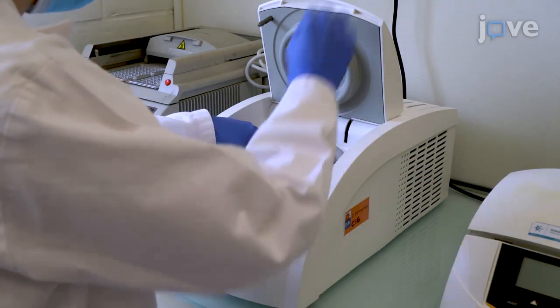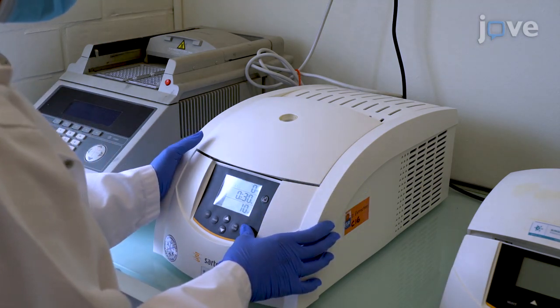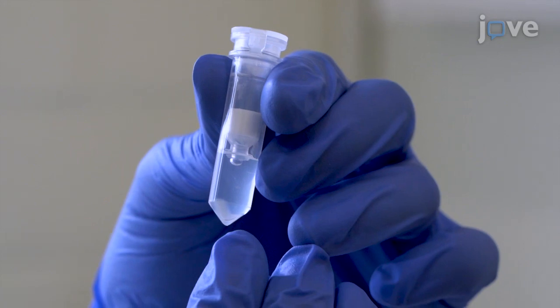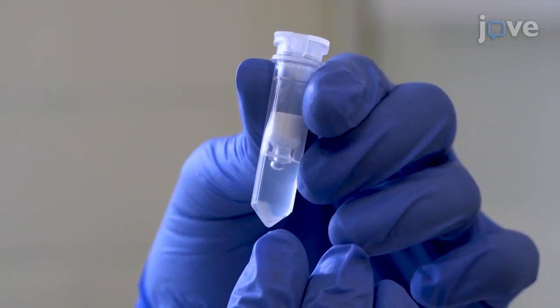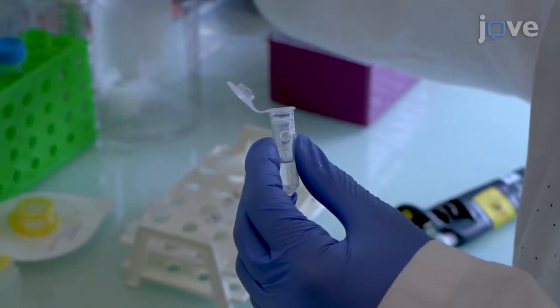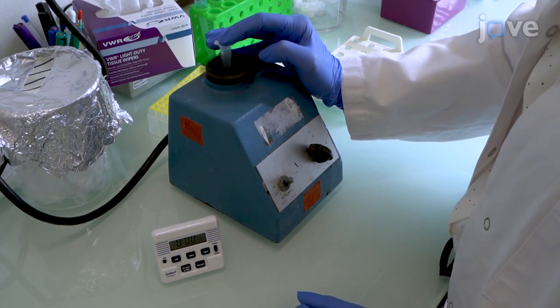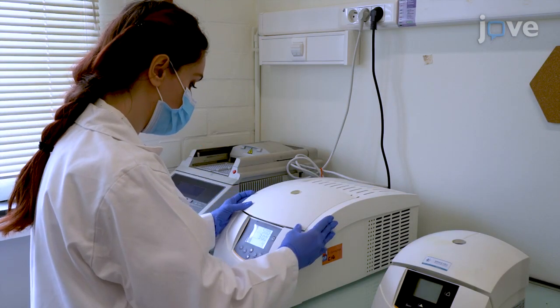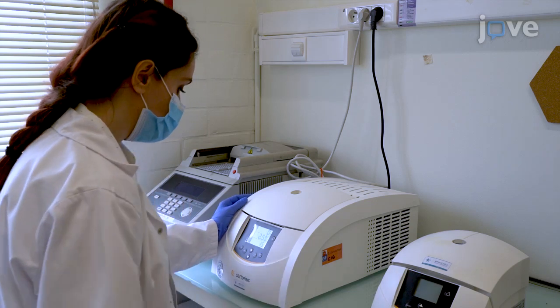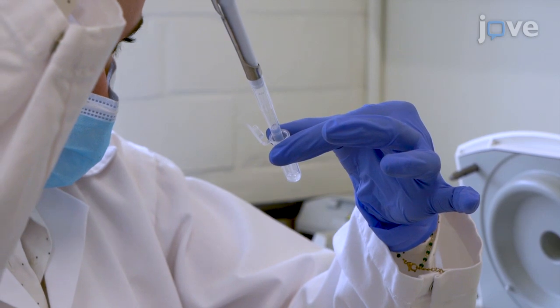Centrifuge the sample tube at 16,000 times G for 30 seconds to rupture the cells. The flow-through contains intact nuclei, which form a colorless pellet at the bottom of the tube. Discard the filter and re-suspend the pellet by vortexing vigorously for 10 seconds. Then pellet the nuclei again by centrifuging at 500 times G for 3 minutes, and carefully discard the supernatant.